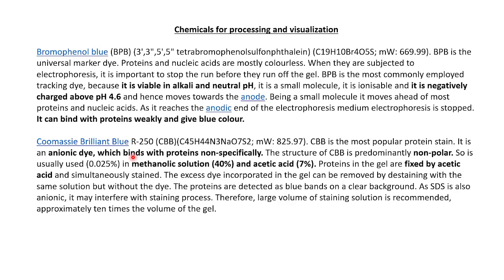Okay. So that's all about SDS-PAGE or gel electrophoresis and agarose gel electrophoresis. I guess it will be covering most of the questions that might be asked in the different exams. The later portions are very, very important, where the roles of the chemical ingredients are there, along with the basic principles before that we have for gel electrophoresis, and maybe a few questions can be there depending upon the size, the molecular weights and all.